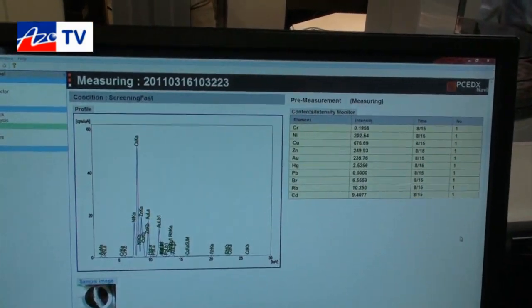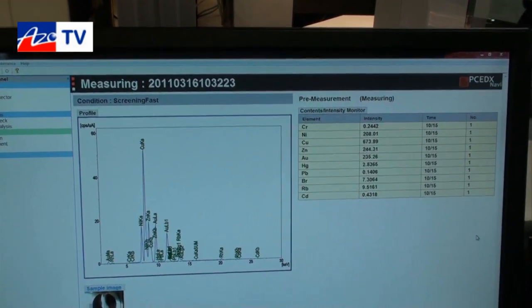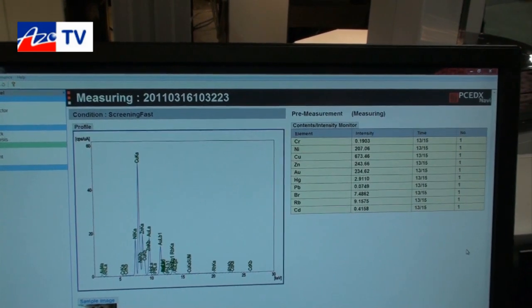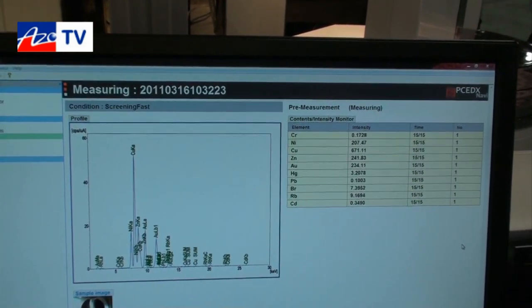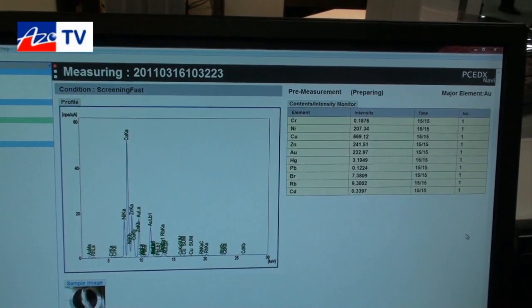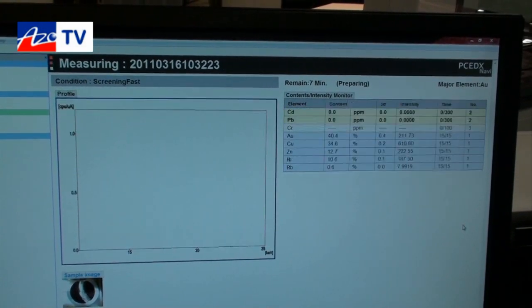Immediately you'll see that the system has already started to generate spectra. We can see that there is gold, nickel, copper, zinc, and other elements present in the ring. This system is designed for applications where the user is not necessarily an expert or even a novice user of X-ray equipment, but can simply put a specimen in and have the system generate data accordingly.